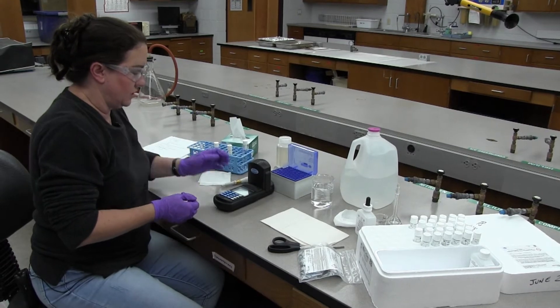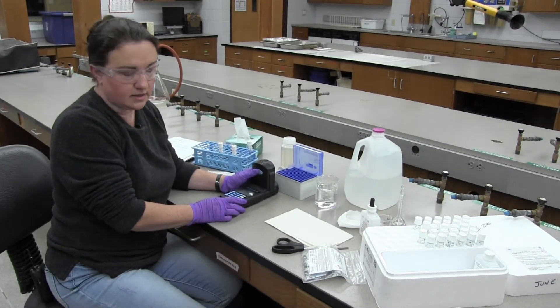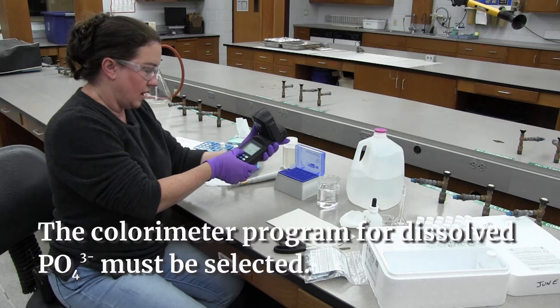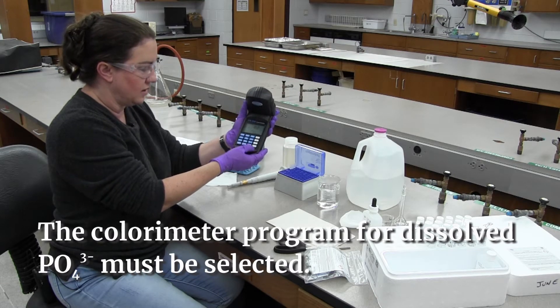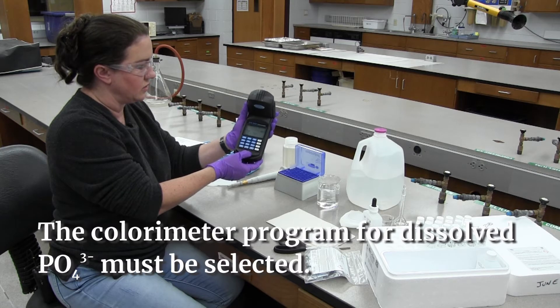The first thing we want to do is program our meter to do the phosphate test. You can run numerous tests on this one colorimeter. I'm going to go through the keystrokes and show you — we're going to go program 82, enter. That will get us to the PO4 screen.